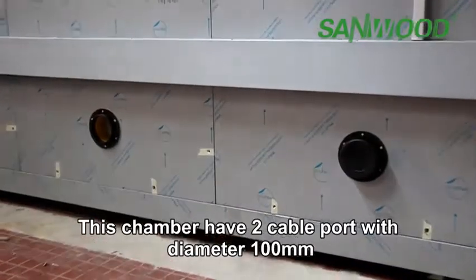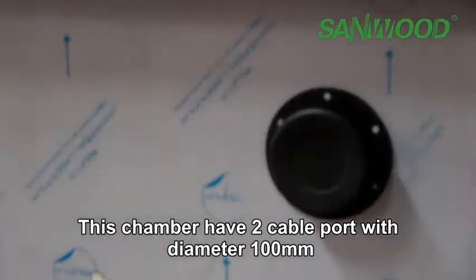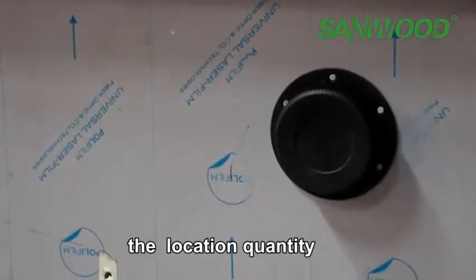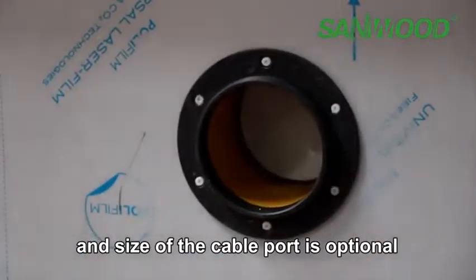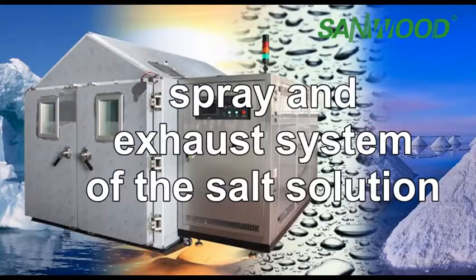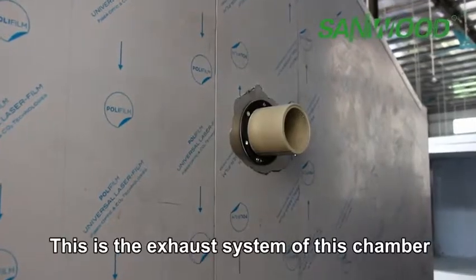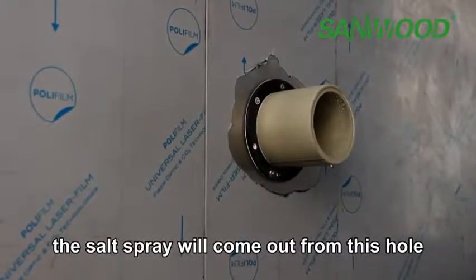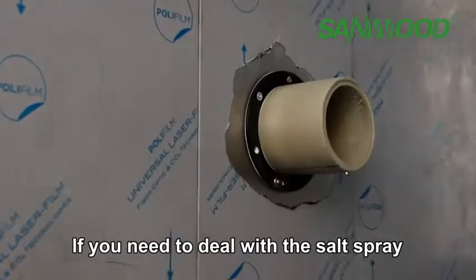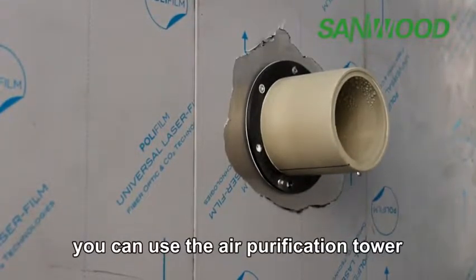This chamber has two cable ports with a diameter of 100 millimeters. The location, quantity and size of the cable port is optional. This is the exhaust system of the chamber — the salt spray will come out from this hole. If you need to treat the salt spray exhausted from this chamber, you can use an air purification tower.